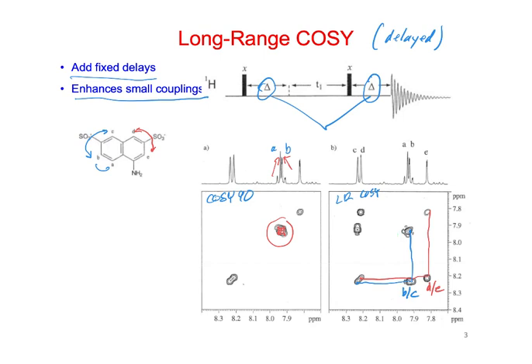But I could imagine if you time this to where those big coupling constants split and they're actually opposite of one another, then when you give the second 90, they're going to all go into the Z direction. So they kind of cancel out. Yeah, I could see that. So I think it would probably be something more like that, selecting rather than just toning down everything. Okay. That makes sense. That's a lot more reasonable of an explanation.